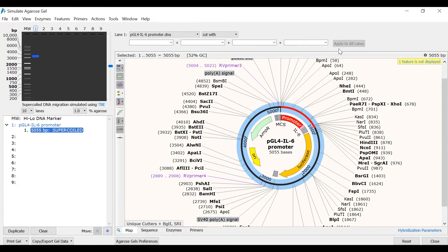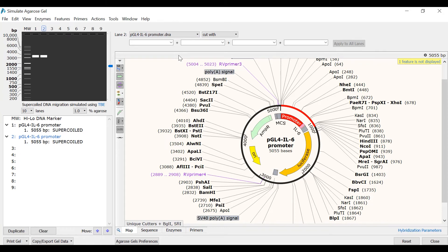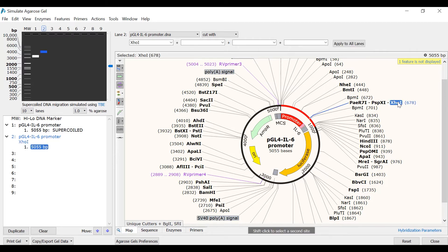I will now see what the agarose gel looks like when the plasmid is linearised. To do this, I will select lane 2 and use the dropdown menu to select the same pGL4 plasmid. To simulate a digest, I will ensure the top dropdown menu states Cut With and then select up to 4 different restriction enzymes. I want to make this plasmid linear, so I will select to cut with a single unique enzyme, in this case XHO1. Now the product in this lane is linear.